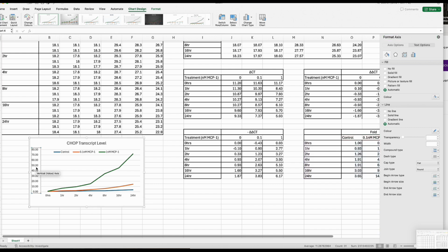Over here, I'm particularly interested in the axes. So now it's asking me if I want to format my axes. When I do that, make sure it says format axes. I want a line. I want a solid line. It's black. And I also want to thicken it up so it's easier to see. Okay. So that's good. I don't close this box out. I actually just moved to, so that was the y-axis. Now I'm going to do the x-axis. I just move over there and click that, and that keeps everything open and easy to find.